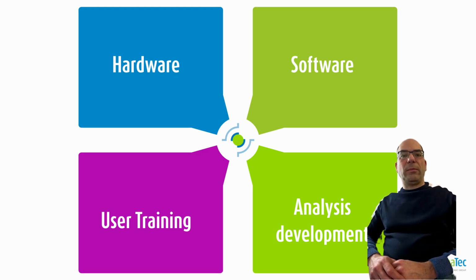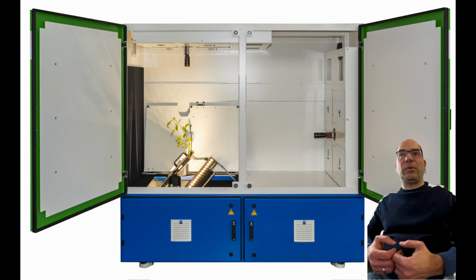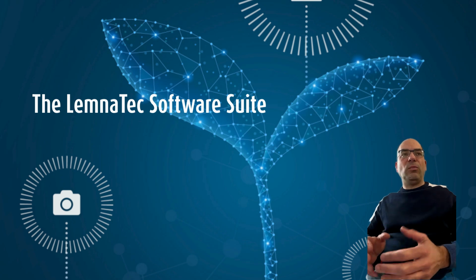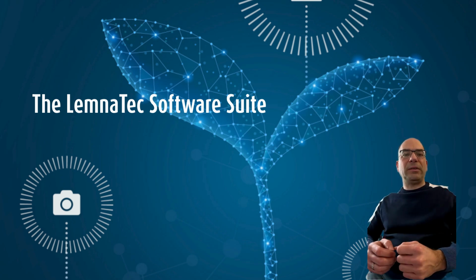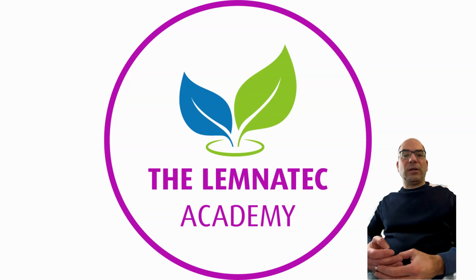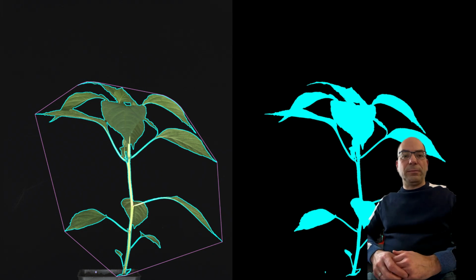Whenever you acquire a plant phenotyping system at LemnaTec, you obtain at first the visible thing, the hardware, of course. You see a plant phenotyping system consisting of hardware where cameras are built in. But there is more beyond the visible hardware part, because our systems always consist not only of hardware, but there is also a lot of software. We provide an introductory training to the system and we develop analysis together with you.